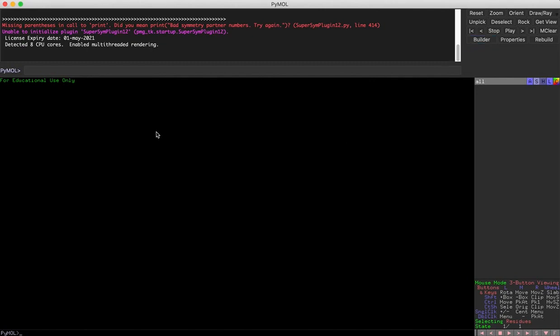So usually the missing residues or the missing regions are short fragments that are missing from the PDB file, so they could not be resolved by the X-ray crystallography method for various reasons. Maybe the resolution wasn't good enough, or the process was very cumbersome, or for that matter, these regions didn't form a structure at all. So if these are very flexible regions, as you have seen previously from the temperature factors, some of these regions appear to be very high in temperature factor, which means they are very, very flexible in nature. In that regard, they could not be resolved by X-ray crystallography, especially. Maybe through NMR methods, they might be resolved to a certain extent.